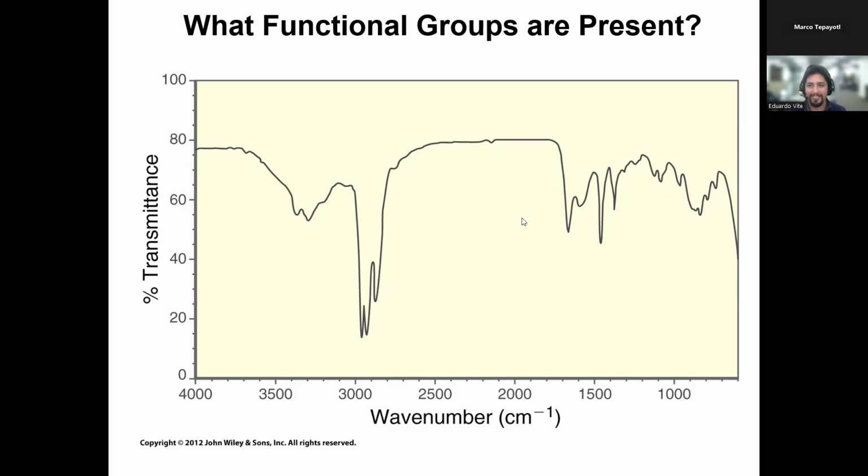CH stretching, yes, and that is good. It's always going to be a CH stretch, that stalagmite pattern at around 3000. And then Daniela asked, is it an amine? It is definitely an amine. You get the very distinct amine peaks between 3300 and 3500. What type of amine? Is it primary? Is it secondary? It tells you right there. You can look at the number of peaks. Primary. Yep.